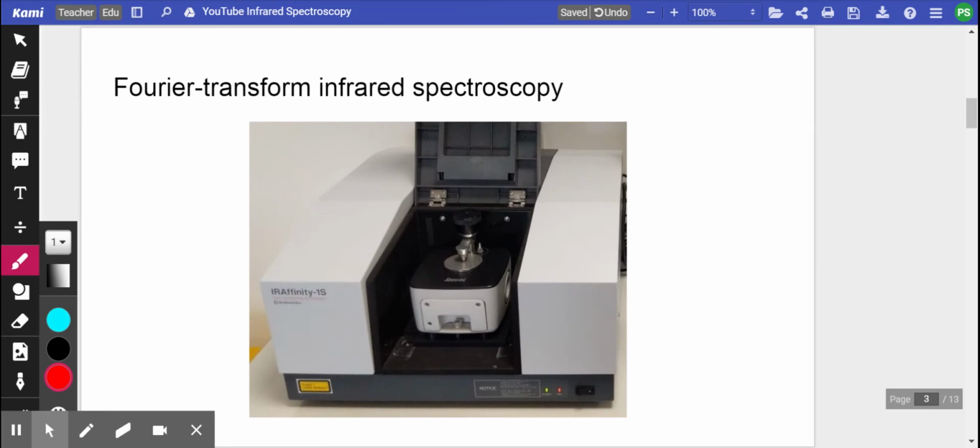Now, in a laboratory, what you can do is place your sample in one of these pieces of equipment called the Fourier transform spectrometers. And what the machine does is emit infrared light through the sample. So some wavelengths of light are absorbed and others are not. And that depends on the bonds present in your molecule.